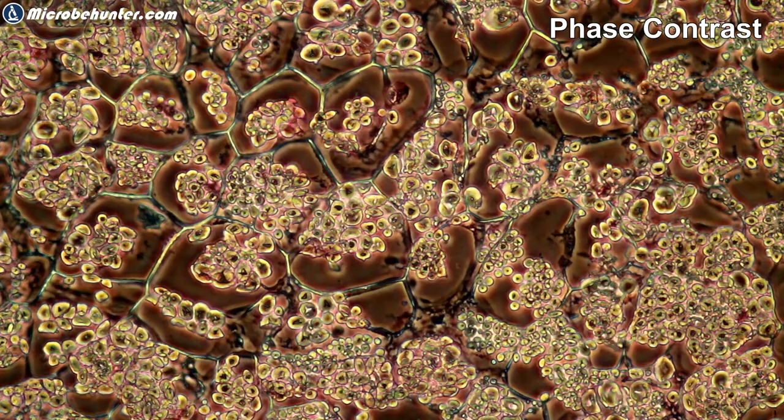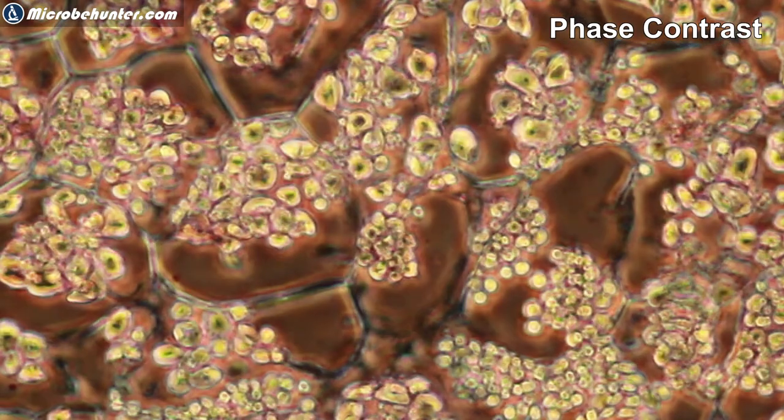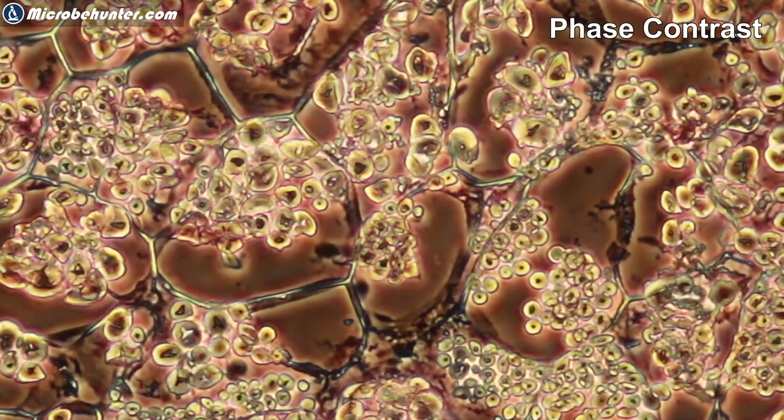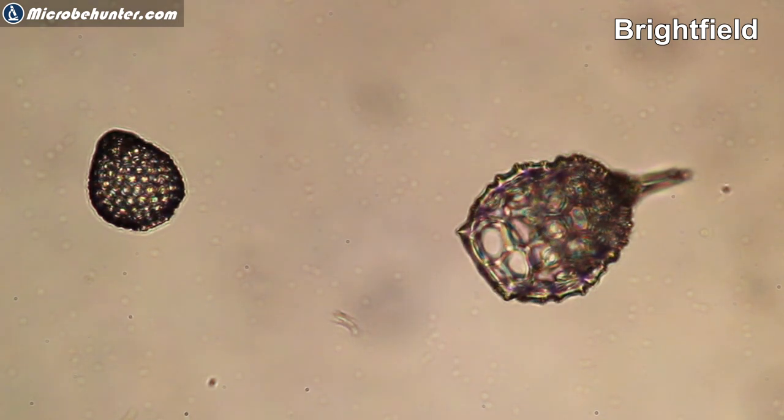Now cropped in a little bit, and now the starch grains are yet better visible. And you might also notice that the structures have a bright halo around them. And that is typical for phase contrast.